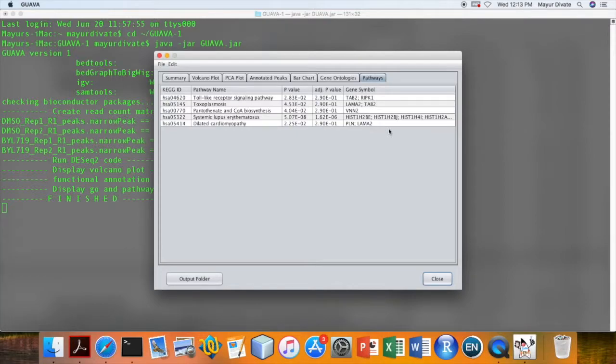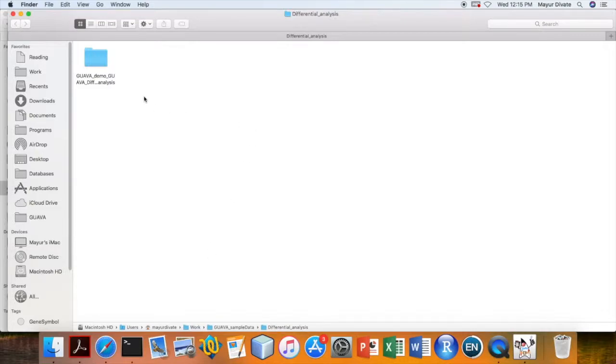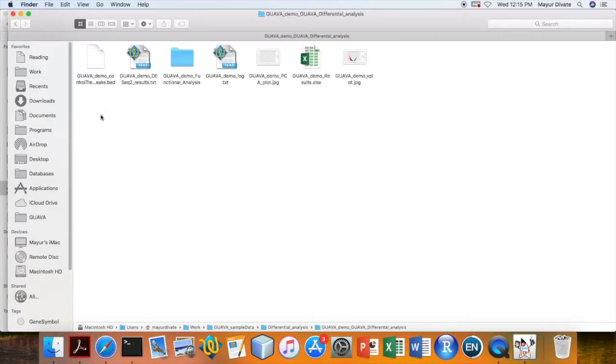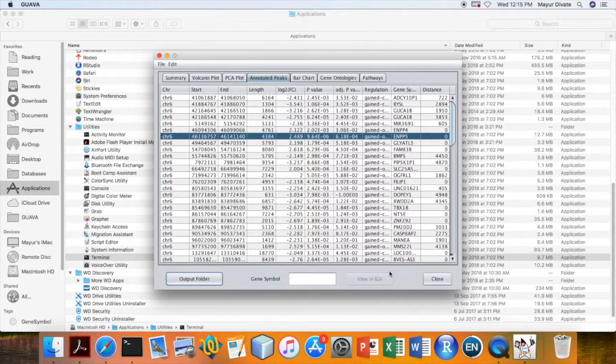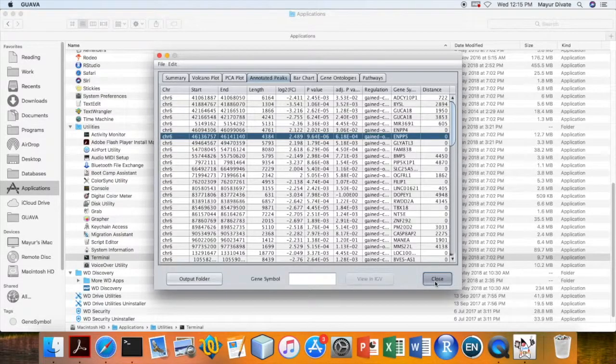Click on the output folder to view analysis files. It will take you to the output folder directly. Click on the close button to close GUAVA. This is the end of tutorial.